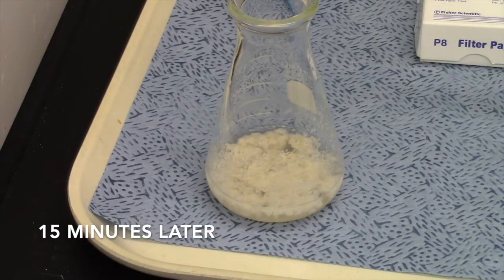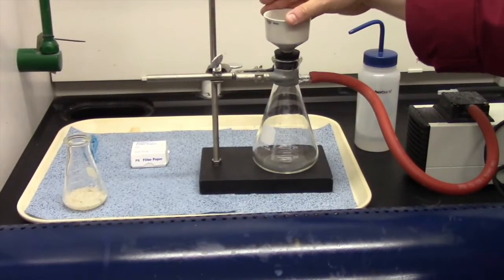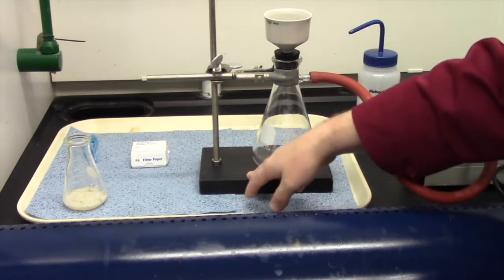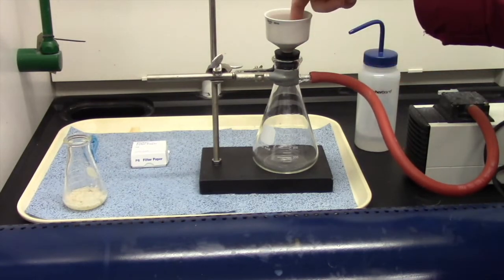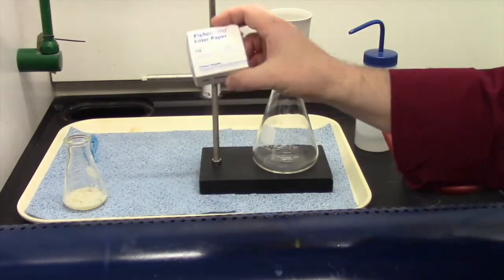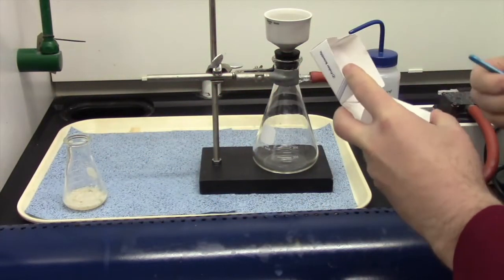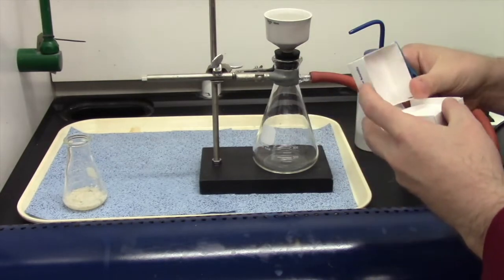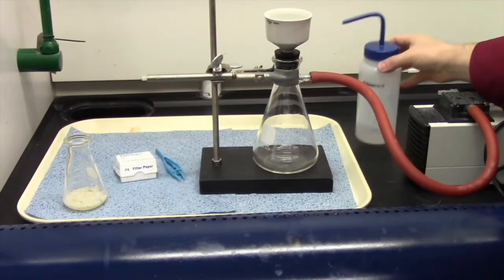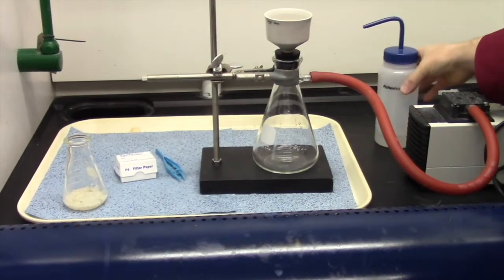All right, guys. We waited about 15 minutes and as you can see our flask is now filled with soap. That is soap floating right there in suspension. Now, here we have what's called a Buchner funnel, a rubber stopper, a vacuum flask, a clamp stand and clamp, and this bad boy is a vacuum pump. It's going to pull the air through the funnel, which is going to help us filter our sample a whole lot faster. Of course, you need some filter paper. We're going to take one of these pieces of filter paper and put it on top. Now I'm going to take a little bit of water and squirt it on here, and I'm going to turn the vacuum pump on.